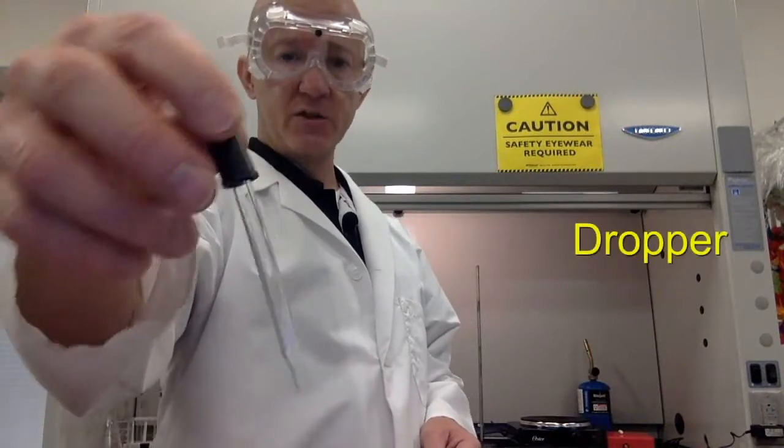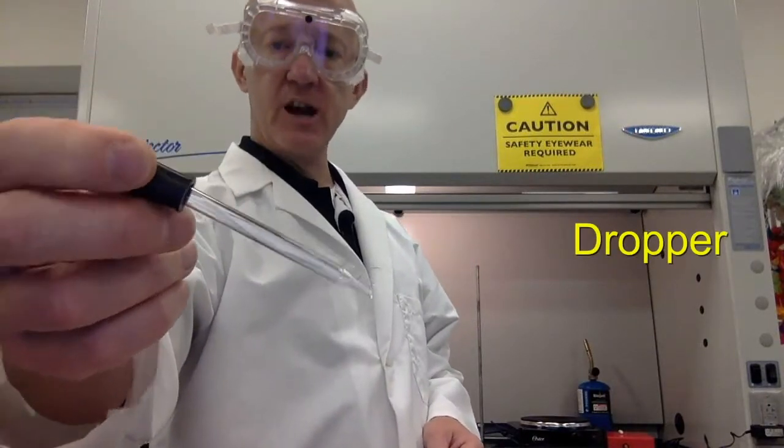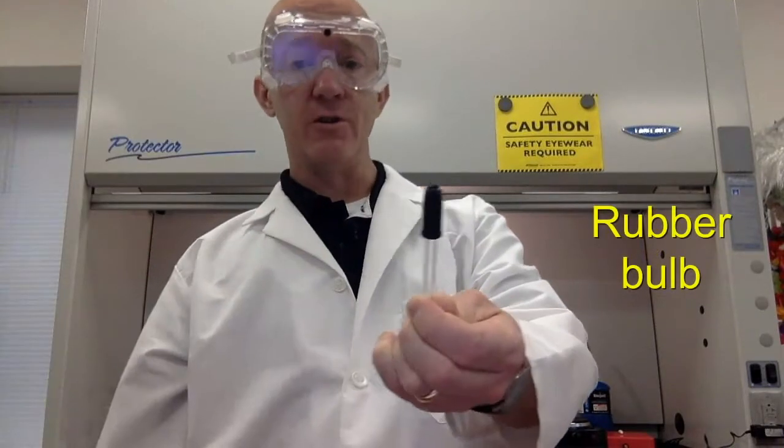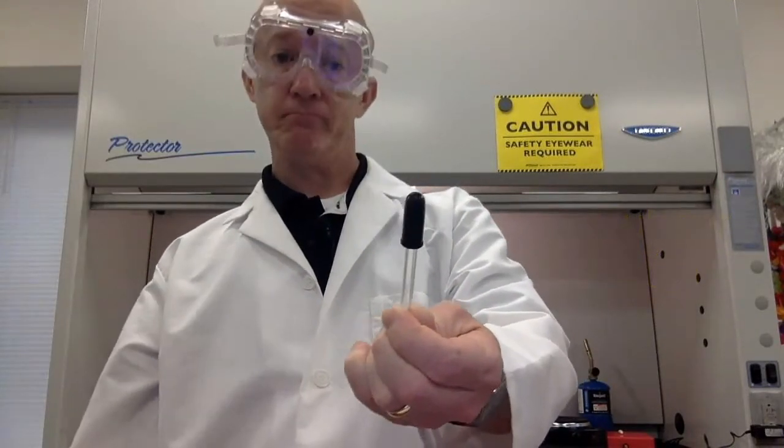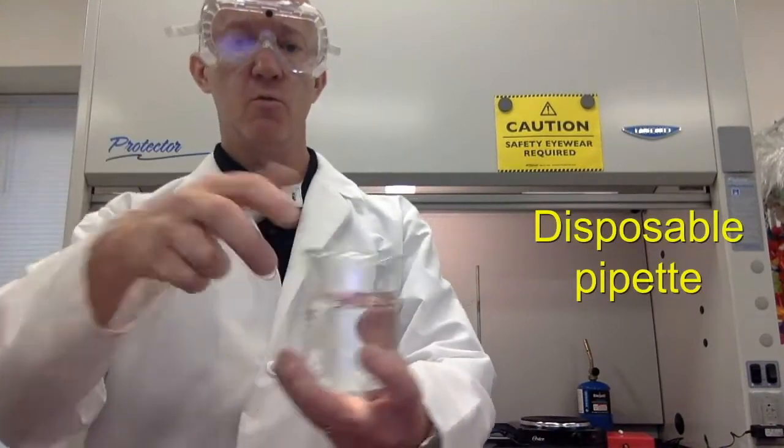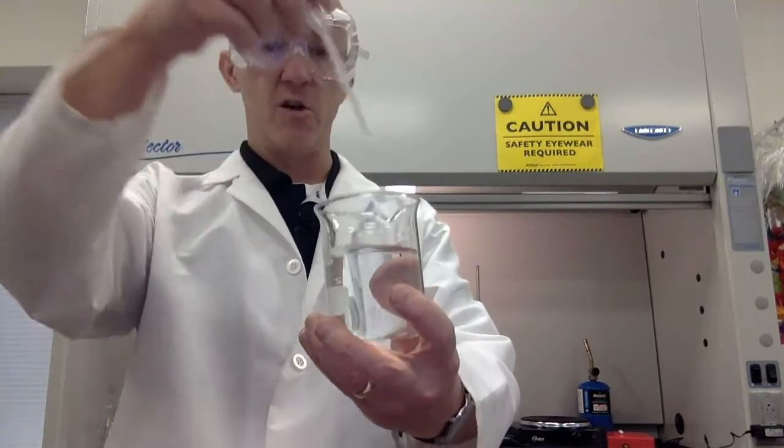This is a dropper. Pretty self-explanatory when we have little tiny amounts of volume that we need to transfer. This is called a rubber bulb. This is a disposable pipette. Again, when you need to transfer small volumes of liquid.